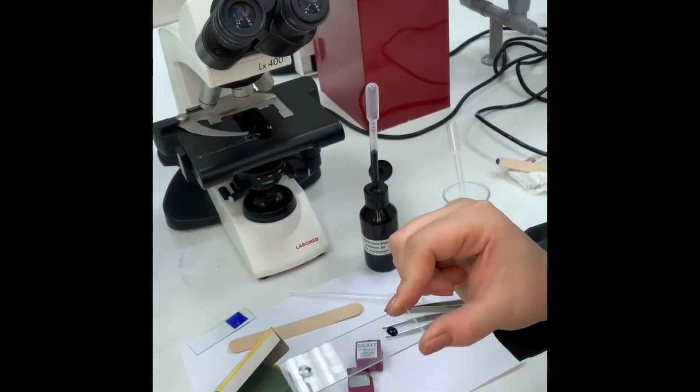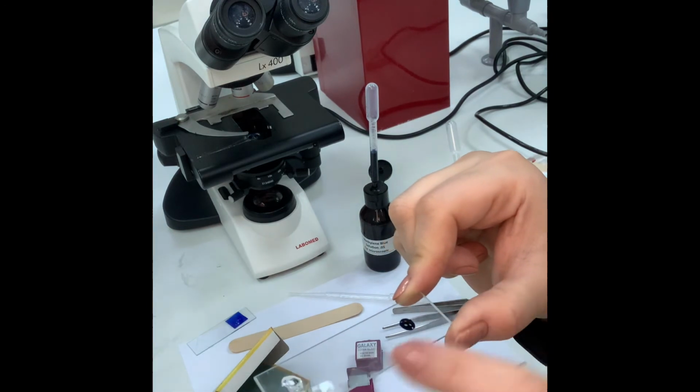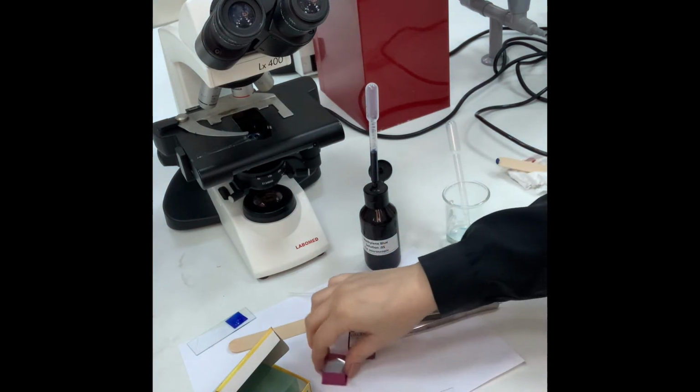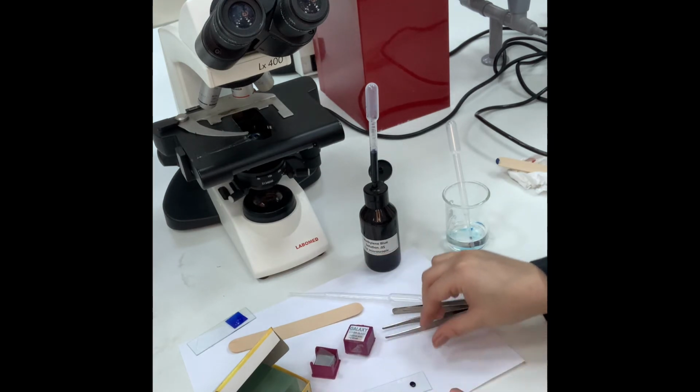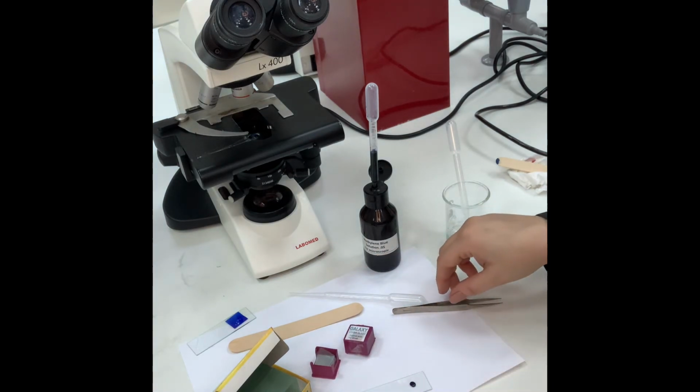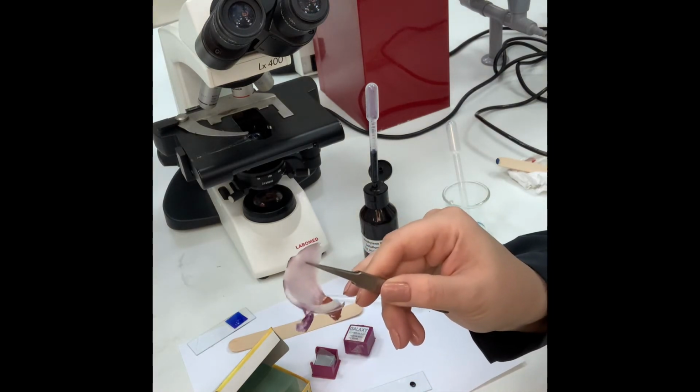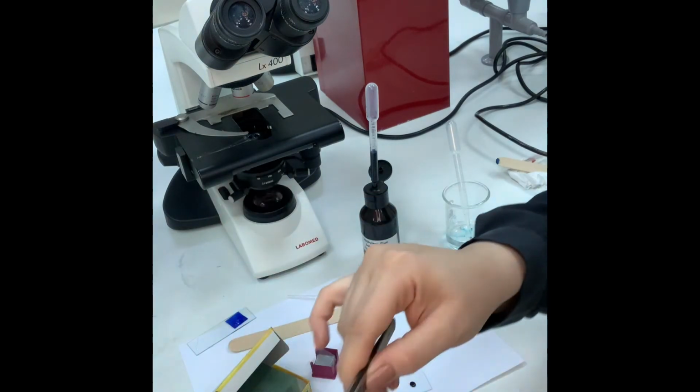Now for cheek cell, same 2 drops, water and stain, but in this case I need to do onion. Did I say cheek cell at the beginning? Yes, onion, real life onion.